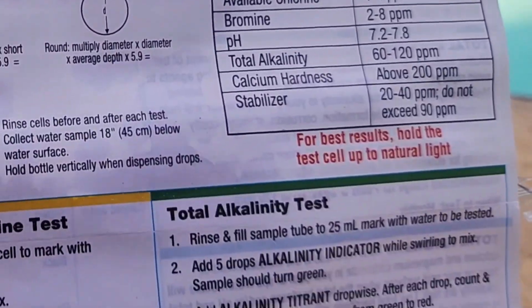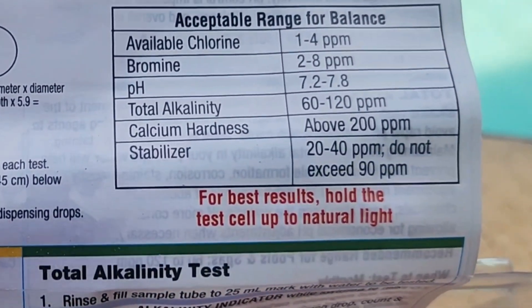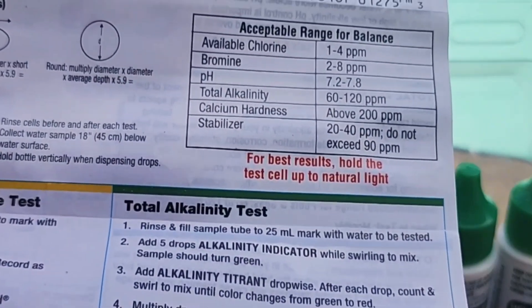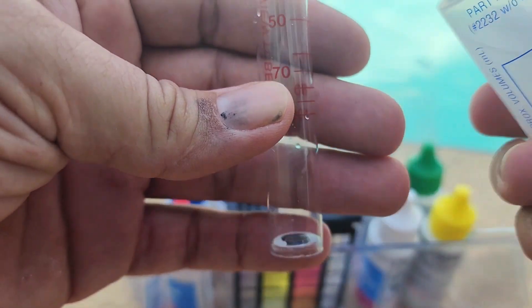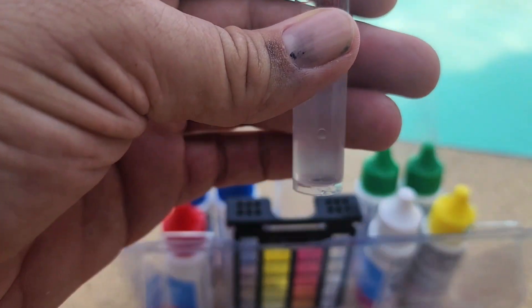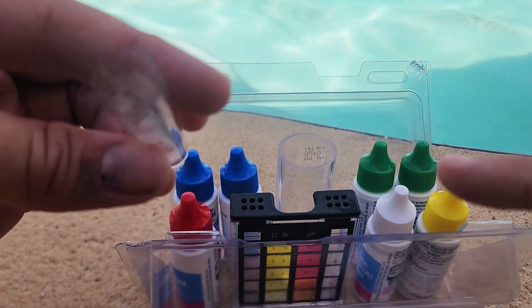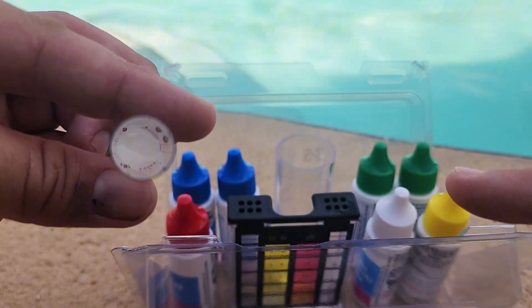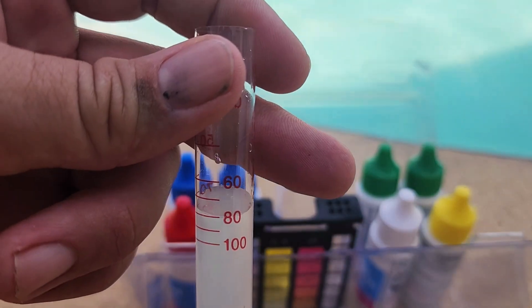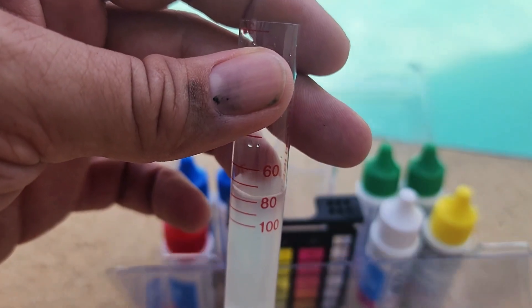This kit does come with instructions that tell you the ranges you should have, so all the numbers are right there. Now that we've mixed the pool water with the reagent, pour it into the little test tube. As you fill the tube, look for a little black dot at the bottom. Once you can no longer see the black dot, that number is your stabilizer level. For me, at about 80, I can no longer see the black dot — meaning my stabilizer level is at 80.